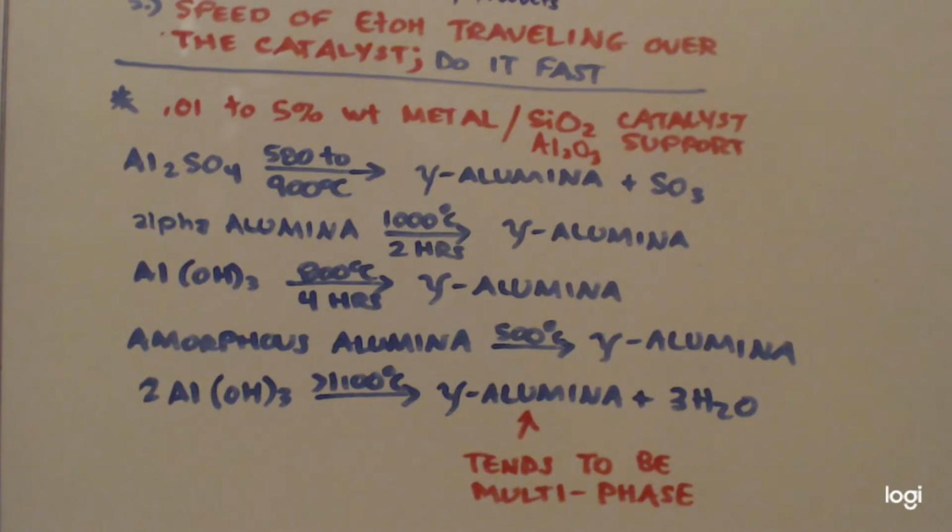Maybe if you have a fan, like a fume hood, that'd be good, I guess. But if you can lead it into maybe some empty vessels that have just a couple mils of water in them, you know what I mean, and put that on an ice bath, maybe you could do that.